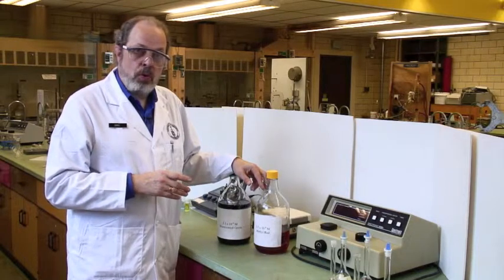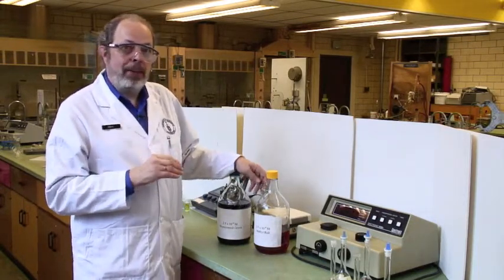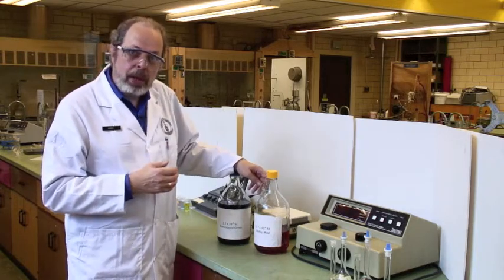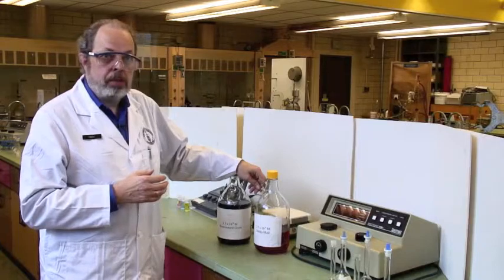You've done this sort of thing before in CHEM 240, so we're going to put in here the video that goes with how to run a spectrum on a Spectronic 20.